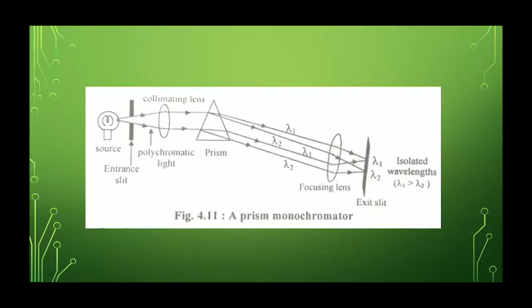See in this figure, light is refracted to different degrees depending on its wavelength. Shorter wavelengths are refracted more than longer wavelengths. Any desired portion of the resulting spectrum can be made to pass through a sample by rotation of the prism. Usually, normal glass prisms are used for the visible range, quartz for ultraviolet, and alkali halide for the infrared region.